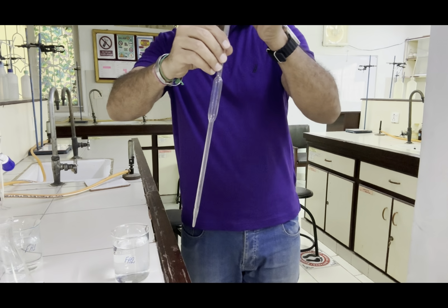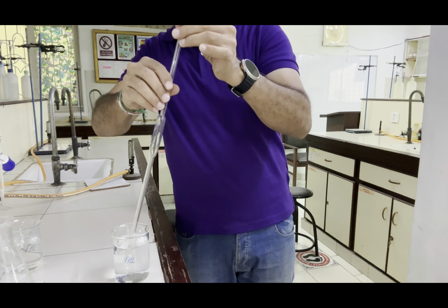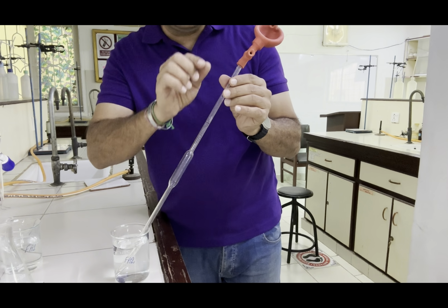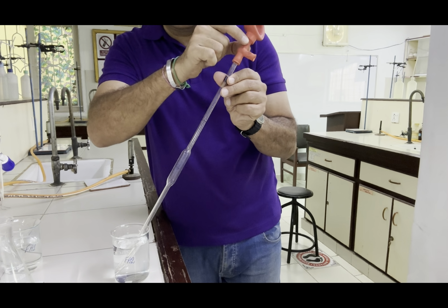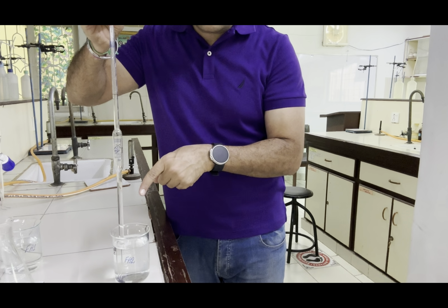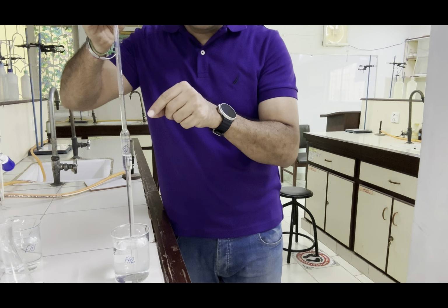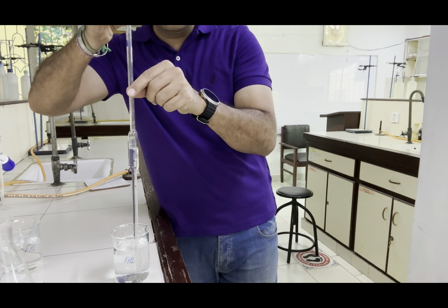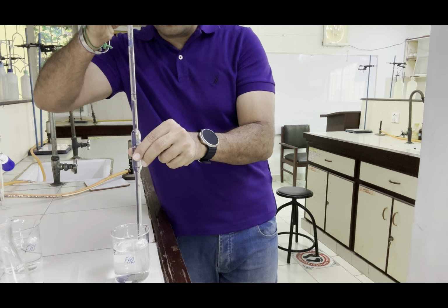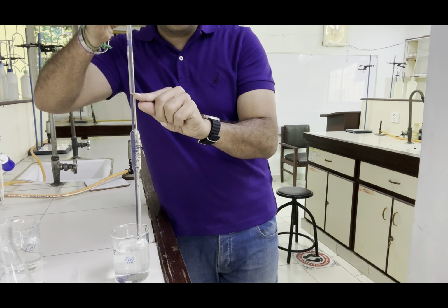Now we will put this pipette into the solution, Fa2, we have to take. Now I will press here this S button. As soon as I press this S button, suction of solution starts. You can see the solution is starting to come up, and I have to stop it at this point where there was a mark.